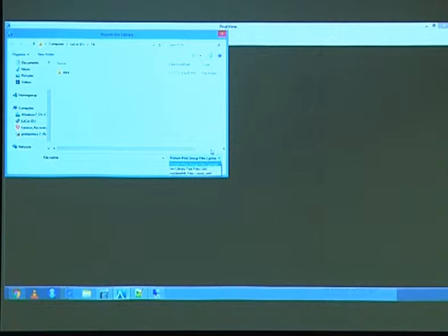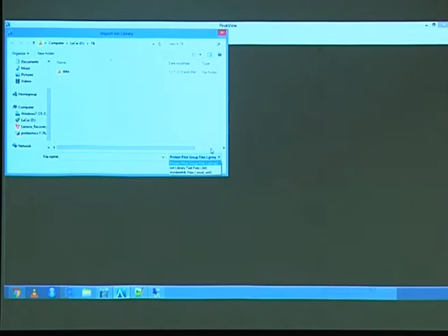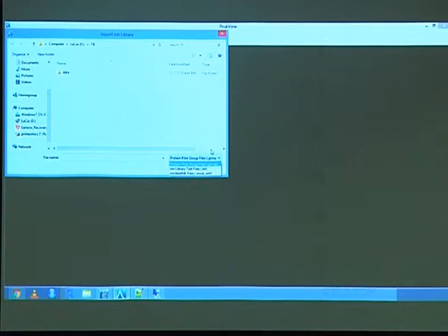ProteinPilot is the search engine from SciEx, and this is the result file that they give you. You can just import it here, which is a neat tool. Otherwise, you can import text files, and it has to have the ending txt. We're going to do this because SWATHProphet doesn't make group files, it just makes text files.